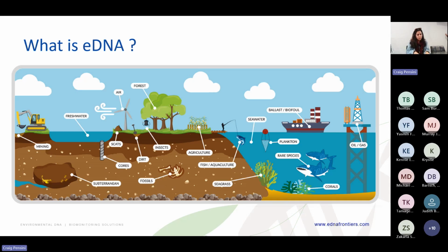And the other thing is the shedding rate of DNA and the behavior of animals, plants and organisms in general. Some shed less DNA than others. If you think about insects or reptiles, especially lizards, they shed less DNA compared to other vertebrates like mammals and birds. And that's important for what we do, because the way they shed DNA, where they shed it and how much they shed will directly impact how we sample and how we find these organisms.